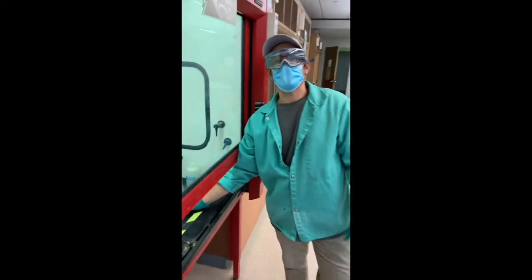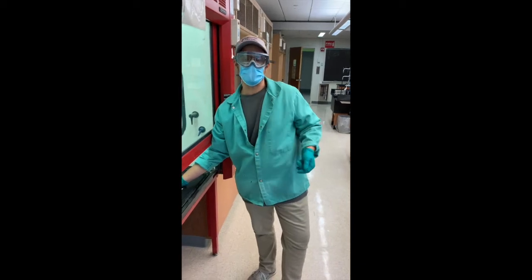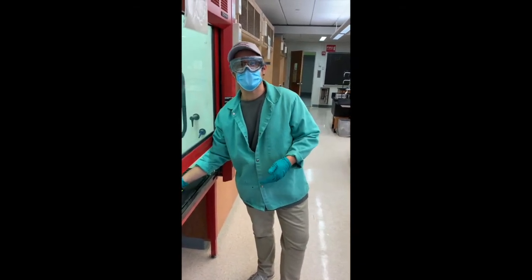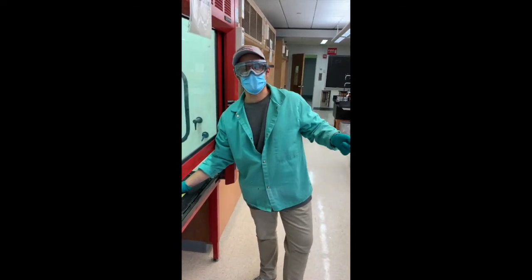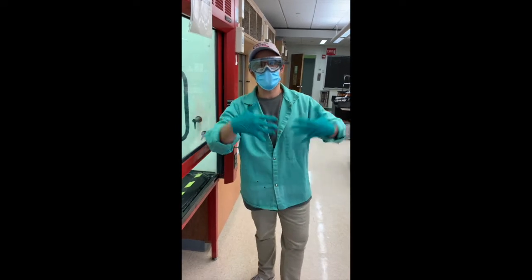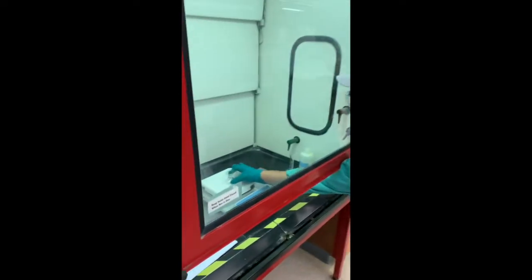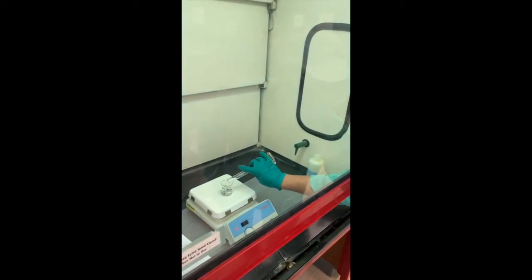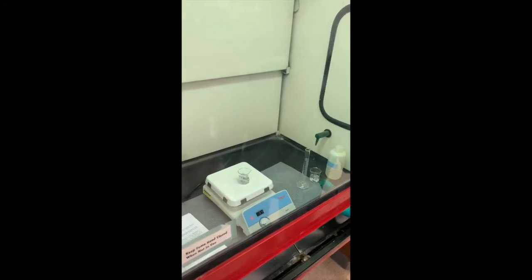Now, since we're looking to speed up the reaction, we're going to be using a hot plate to help facilitate this. Normally, we'd leave it in the hood and swirl every once in a while without heat, but by adding heat, we'll allow it to react more and practice social distancing by not staying in the lab as long as we would have. So, I will now add my potassium hydroxide to my aluminum.